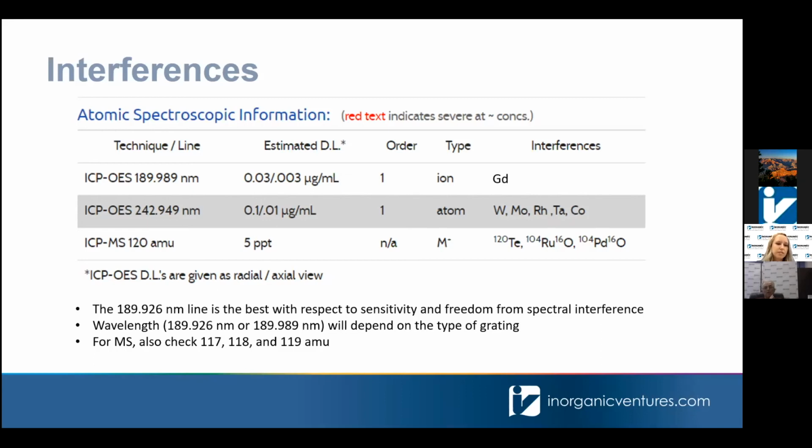Those aren't actually different lines for tin. It just depends on your instrument. But again, that line is going to be the best for sensitivity and interferences.